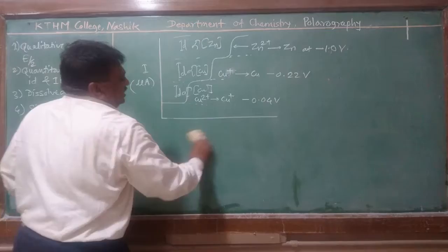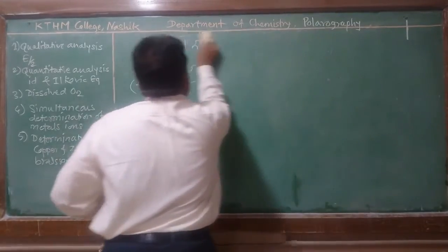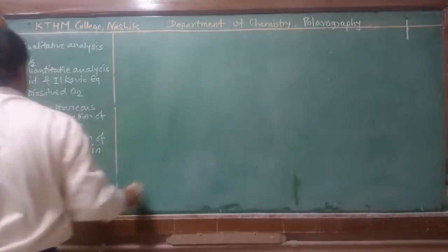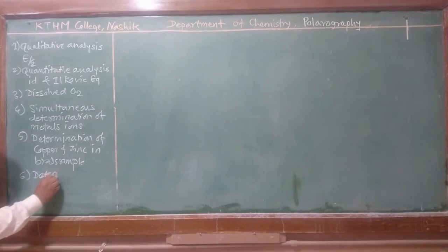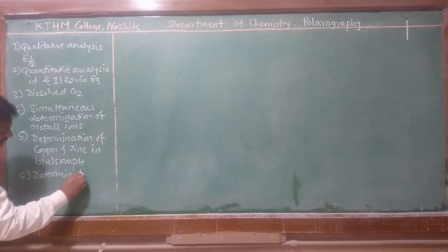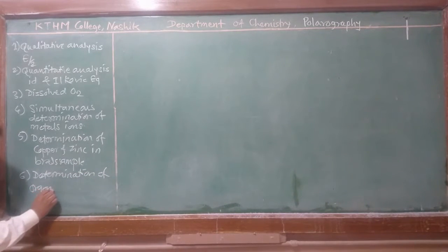Students, now we discuss the next application, that is the analysis or determination of organic compounds.